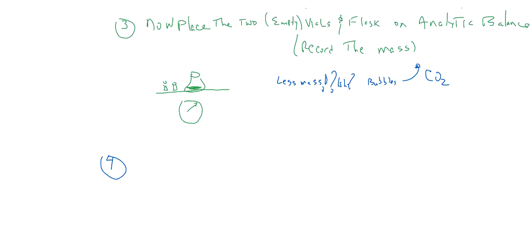Okay, so now the next thing is now use a dropper. And you know what a dropper is, that's that little thing there. Okay, and we're going to add the sulfuric acid. Aqueous. Okay, aqueous, that's the sulfuric acid.